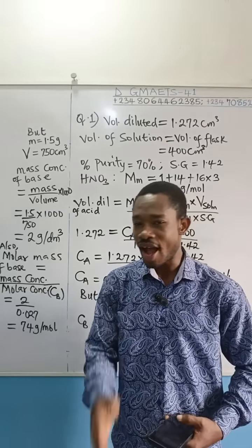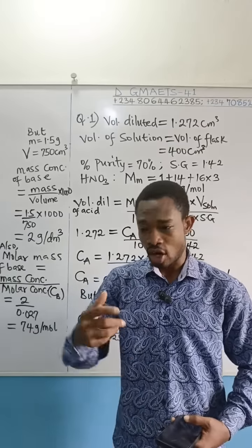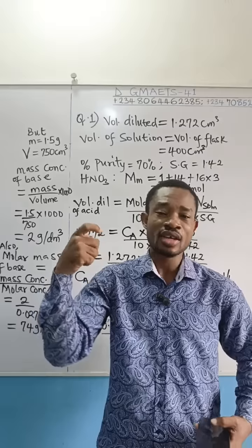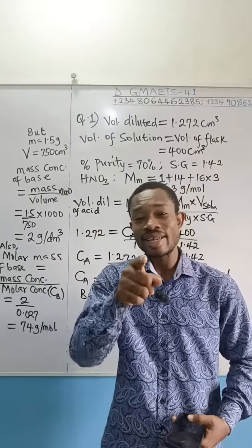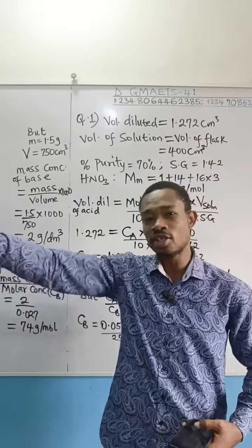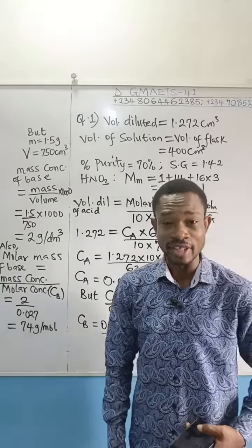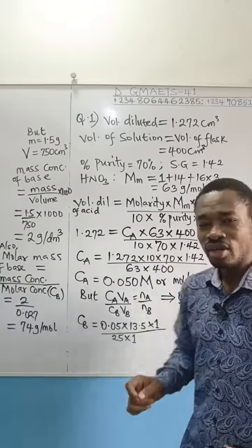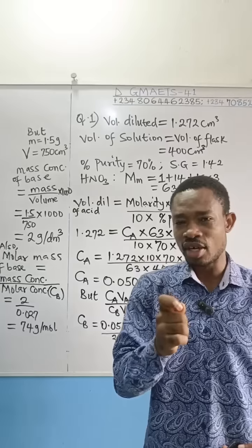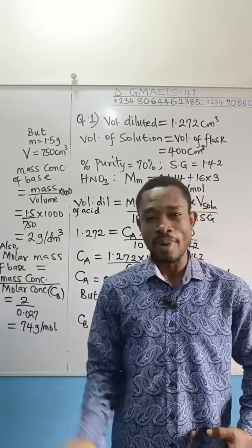Is that okay? I have a video lesson that explains how you can construct your table if you have a suspected titer value already. But like I say, let your suspected titer value not be anything you see from outside. Not even what I'm doing on the board here. VA, please, please, please. You see this VA? Very, very crucial whenever you're dealing with titration. If you don't get it, you're in trouble. And you can't get it from outside.